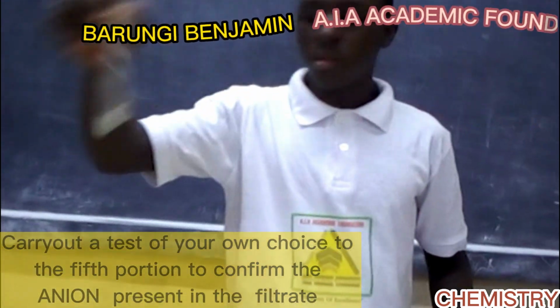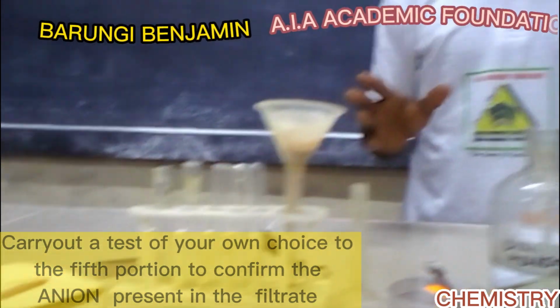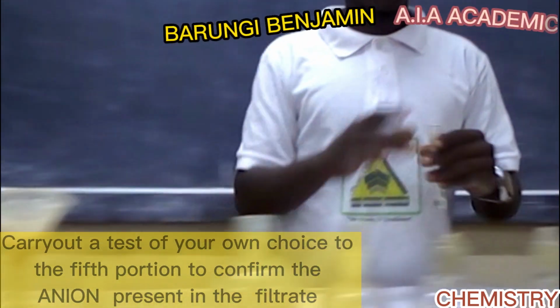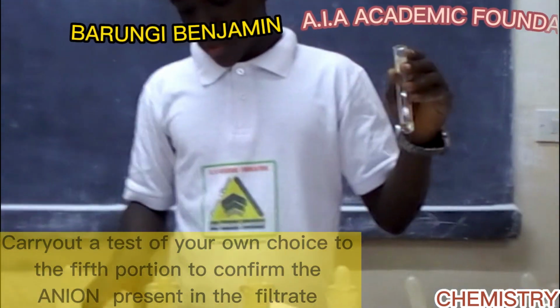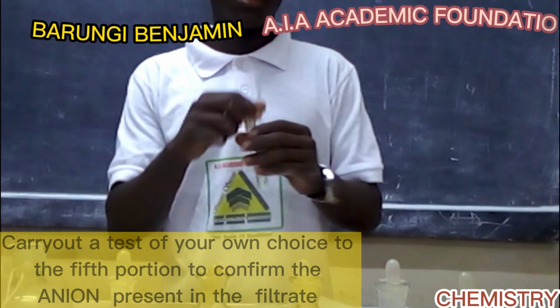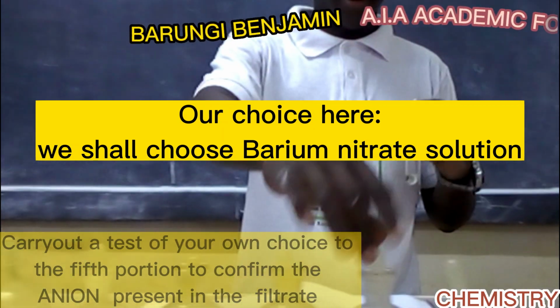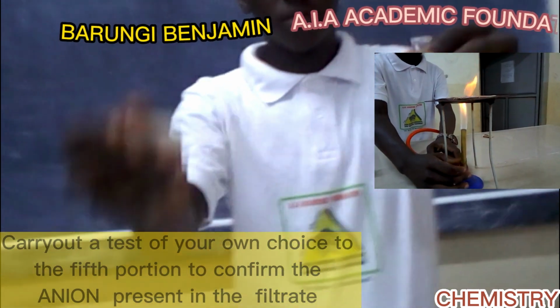So we shall carry out our test to check whether we have sulphate ions in our solution. To test for sulphate ions, we normally use barium nitrate. This is our barium nitrate. We are going to add barium nitrate.